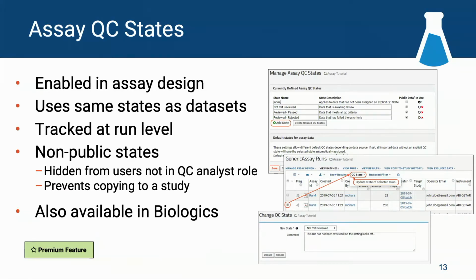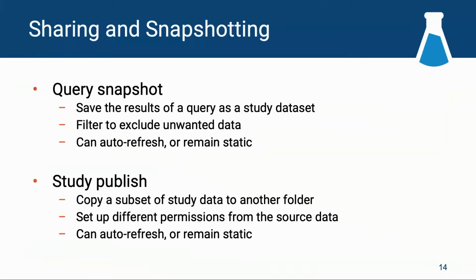It's worth noting that one of the key scenarios that drove this was some of the assay integration with biologics. And so it was great to be able to fold this back into the standard LabKey Server assay views as well.